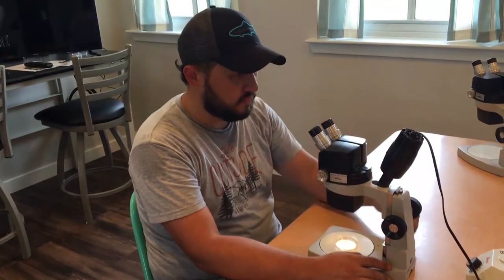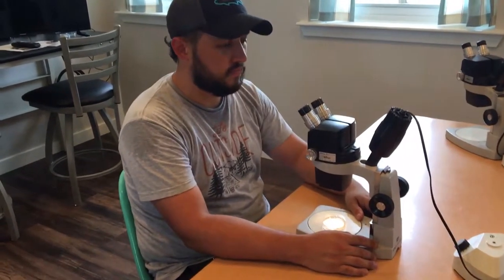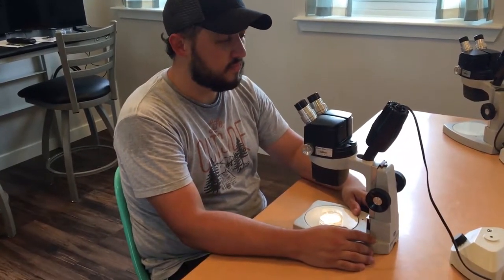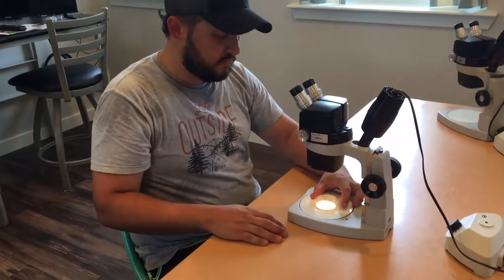Hi, and welcome to IPM Experience House. This video explains the use of microscopes here at the house. These are basic stereo microscopes and are sufficient for most day-to-day insect ID tasks that your business will need.